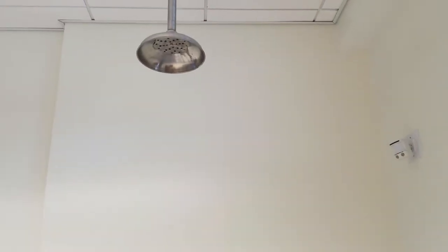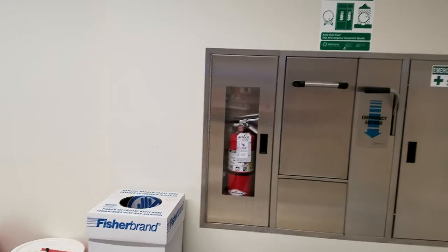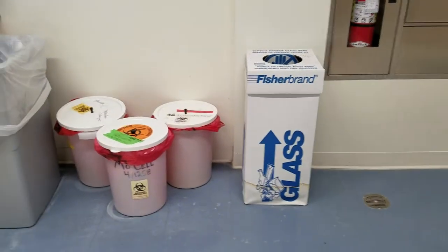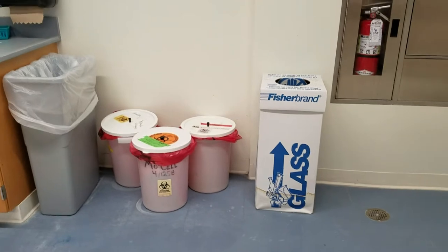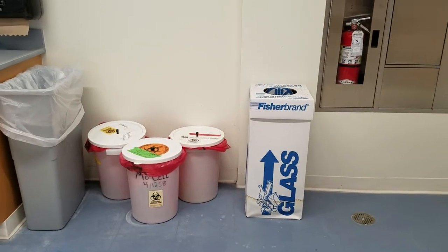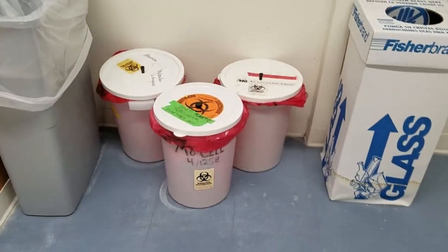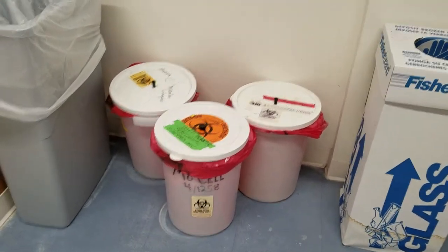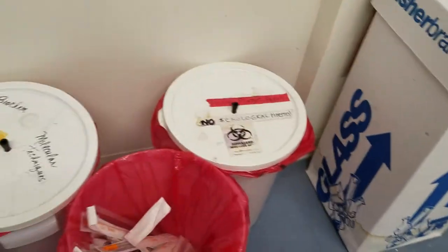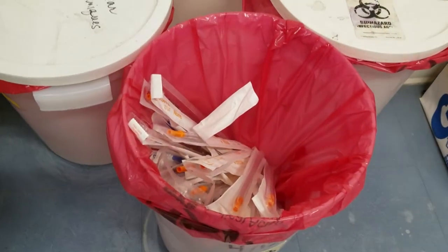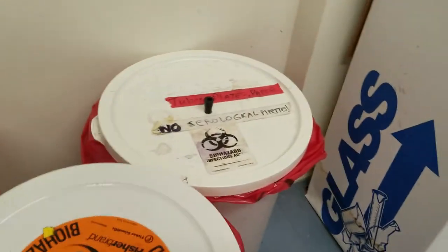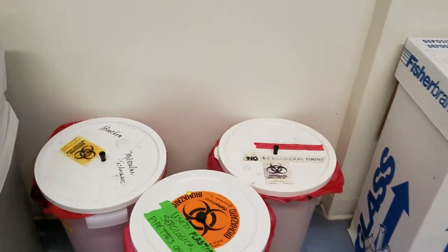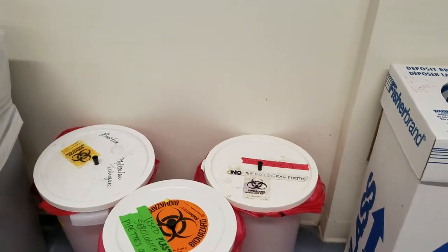There is the shower - it pours about 30 gallons of water straight onto you in case of emergencies. Then we have our glass container where broken glass goes in, and then we have various types of biohazard waste containers. One of them is used specifically for serological pipettes, and the other ones are used for other types of waste that we may have.